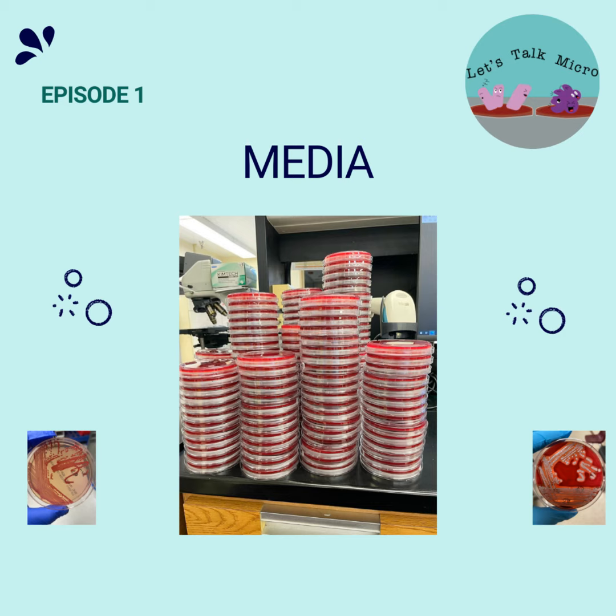And you might keep wondering, why does he keep repeating this over and over again? Well, let's just say that I have dabbed in teaching, and I have gotten this answer a lot. When I ask which kind of media MacConkey is, I get a lot of the selective for gram-negative. And once again, that's the wrong answer.